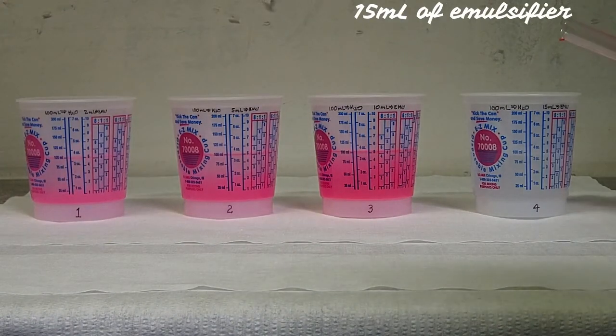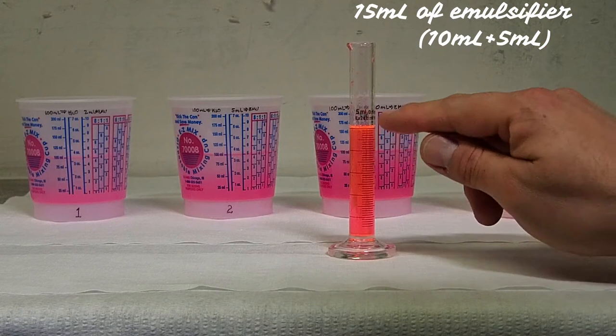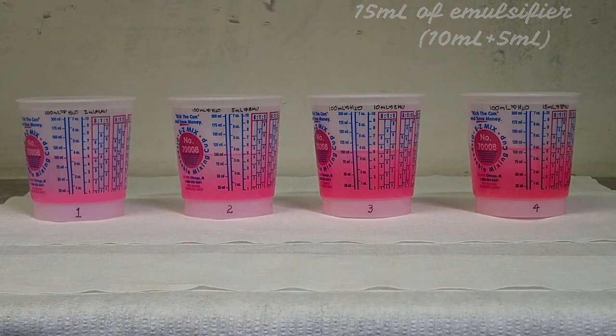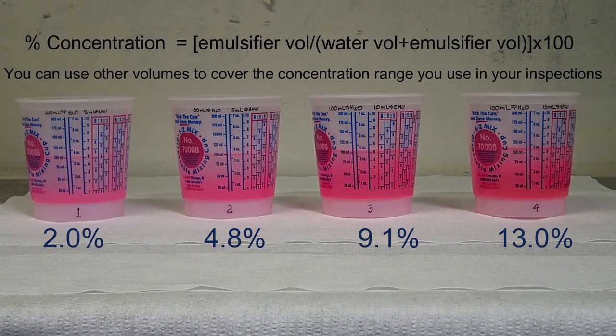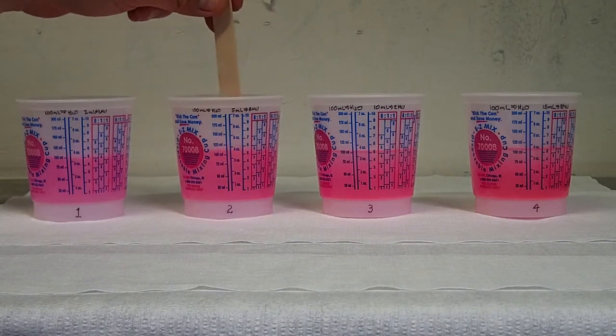For the last sample I am using 10 milliliters plus 5 milliliters because I don't have a cylinder which can measure 15 milliliters. You can use syringes to measure these volumes. So each sample has the concentration shown. Stir each sample to have good mixing.